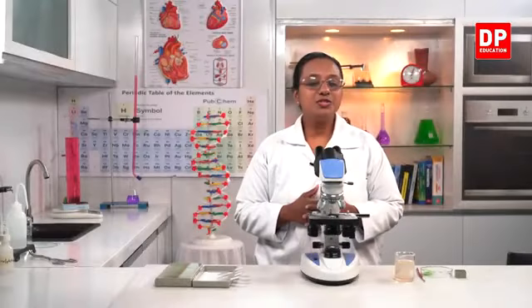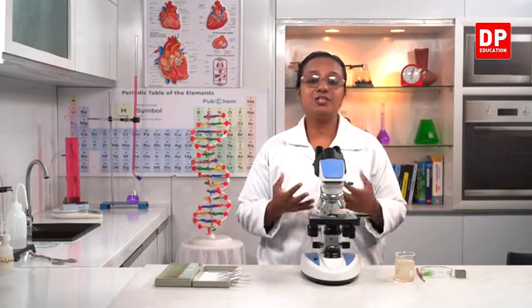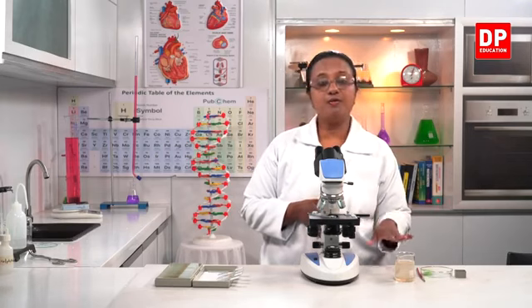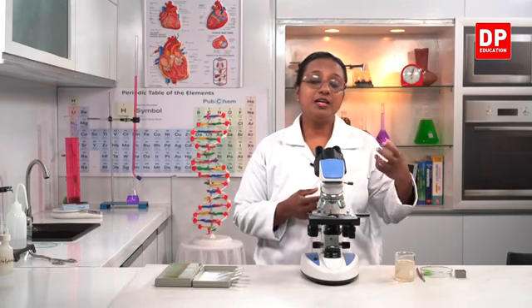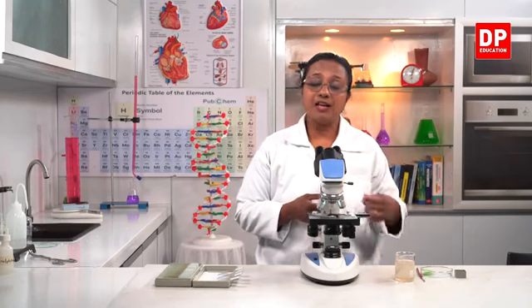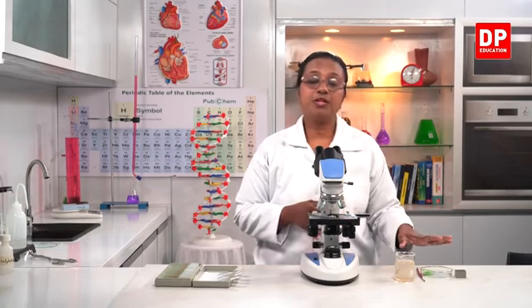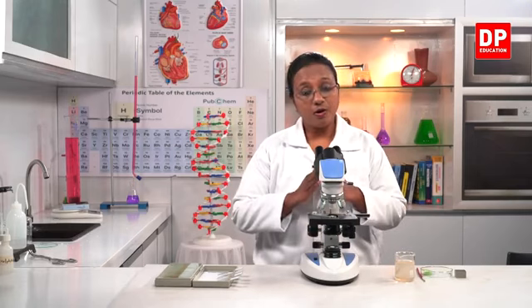So now we are going to observe or try to understand the organizational levels of an organism. To do this, we have an activity where we observe a sample of pond water, or you can use the water in which you have soaked hay for some 2 or 3 days. From that hay extract also you can observe. So here I have pond water. From this I am going to prepare a temporary slide and observe to see the microorganisms present.